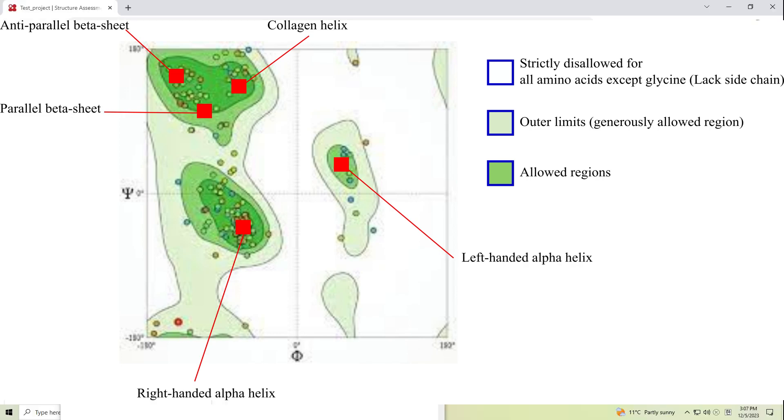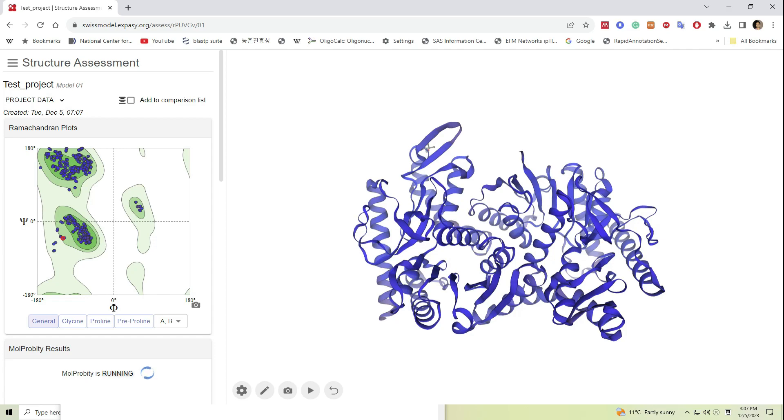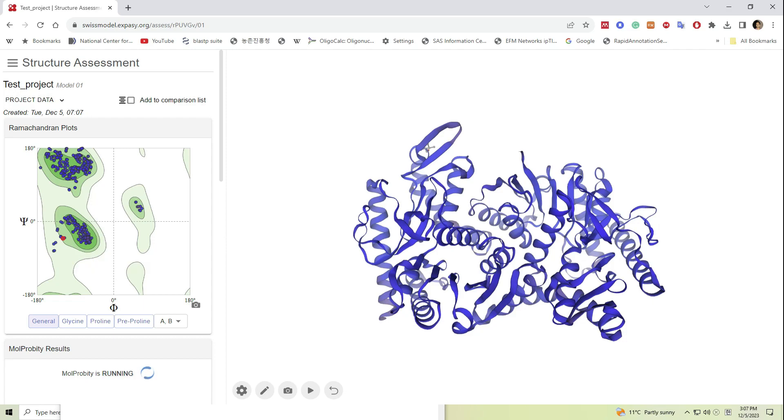For this model, none of the amino acids fall into non-permissible regions. This means structure accuracy is high and no amino acid falls into Ramachandran outliers.